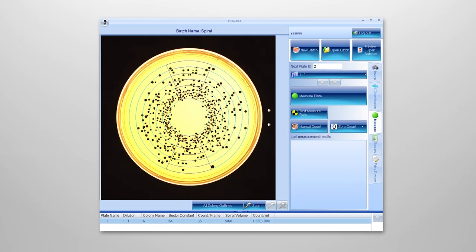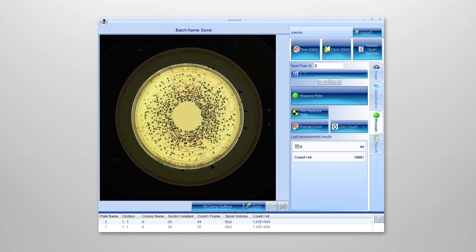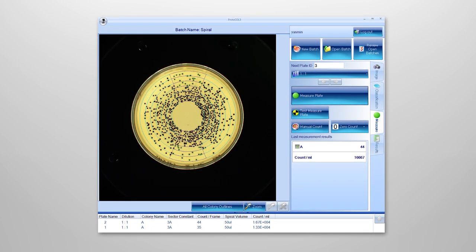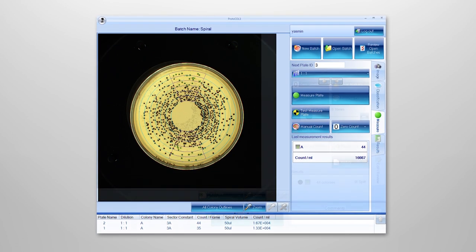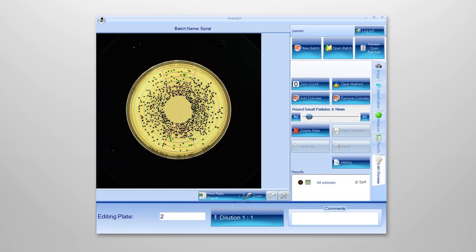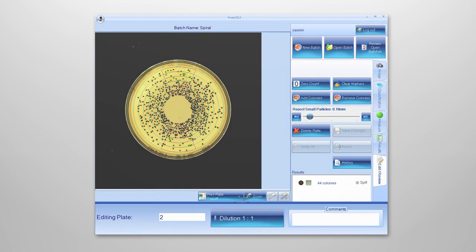Spiral plates are also perfect for use with automated colony counters. Using an automated counter, colony counts are performed in seconds and parameters such as plate identification and dilution factor are recorded, together with an image of the plate for complete traceability.